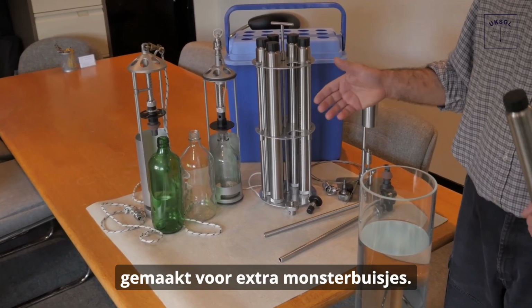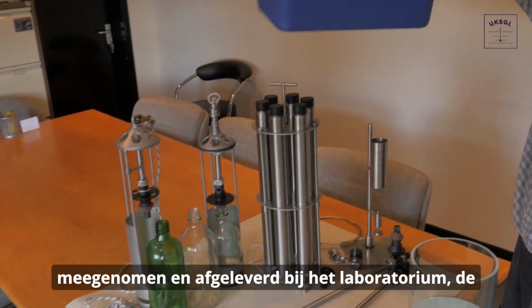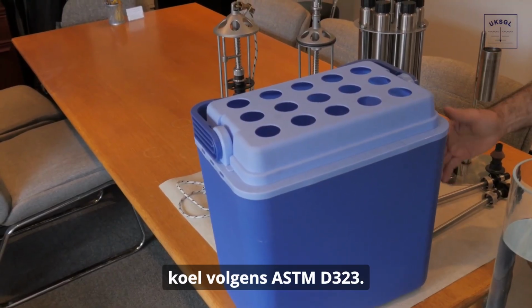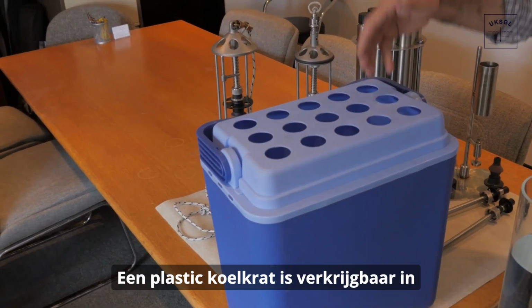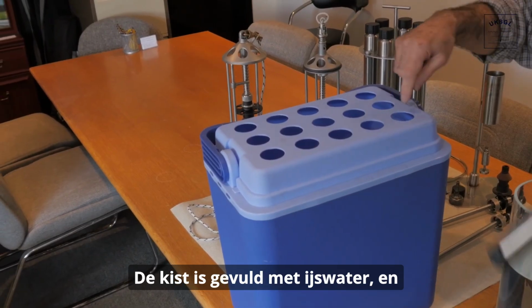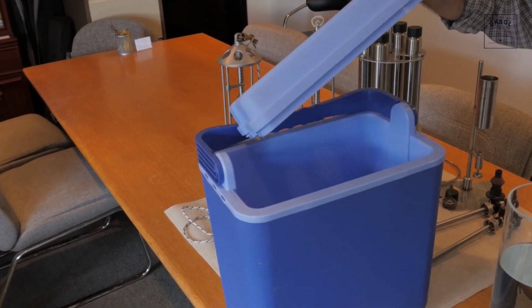sample tubes. In the time between the samples being taken and being delivered to the lab, the samples should be kept cool as per ASTM D323. A plastic cooling crate is available into which the tubes can be stored. The crate is filled with iced water, and the tubes are placed inside with the black caps at the bottom.